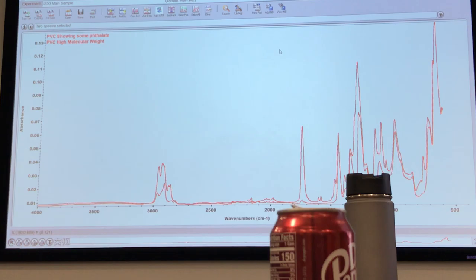What you will collect, and you guys will have access to your lab here as well, the most common thing you will see deposited there is going to be skin cells. Then you'll have a couple of fibers that will come through, and you will also see some silicates. If the air filters are not working at the best levels, you will see a lot of silicates come in. Whenever we open one filter in our lab, we know we have already introduced silicates in it, because our labs are just simple office room labs. So, great guesses. What are the sources of the silicates? Dust. Just dust particles.